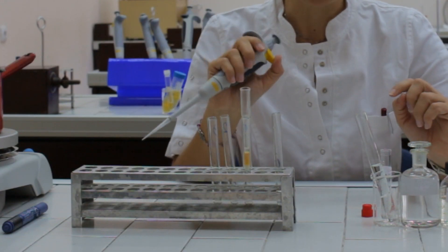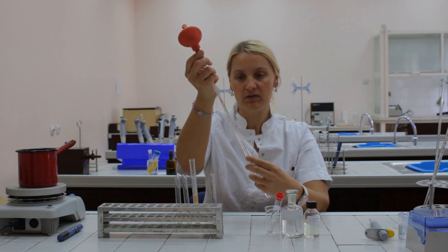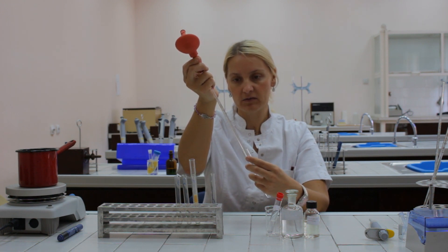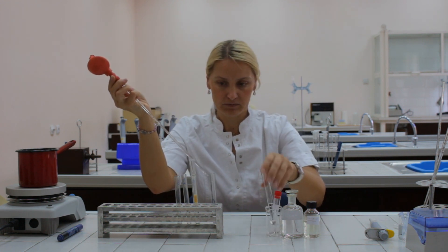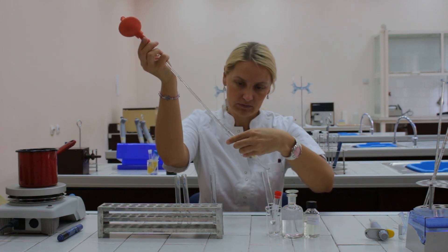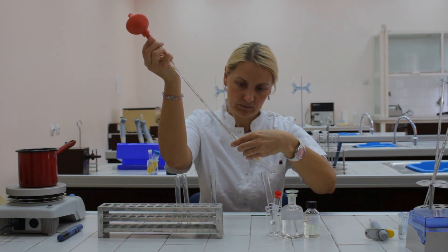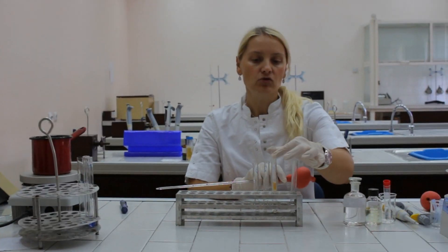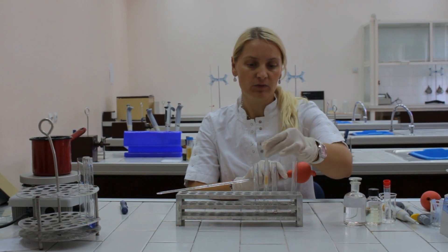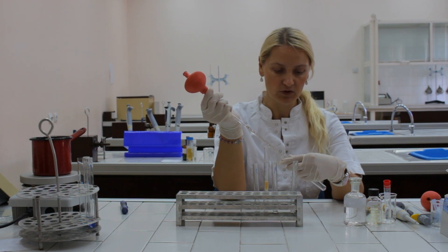Let the solution flow into the chromatographic column completely. The next step is to add one milliliter of distilled and deionized water very slowly to the chromatographic column. Again, let the solution completely flow into the column. Now transfer the chromatographic column to test tube number two and add a new aliquot of one milliliter of distilled water above.